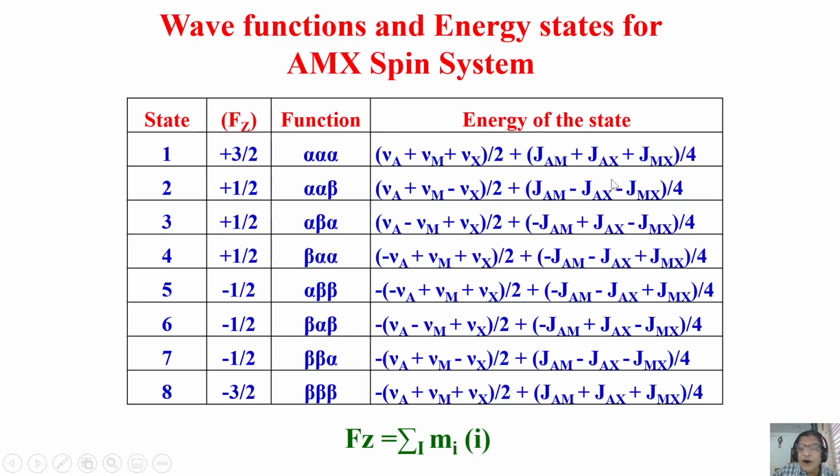So you can find out all the possible transition frequencies, and you can work out how many transition frequencies there are, and with respect to the center of the chemical shift, how the peaks are moved, how much they have moved. So you can find out. Take for example this peak. Take the difference between 1 and 2.